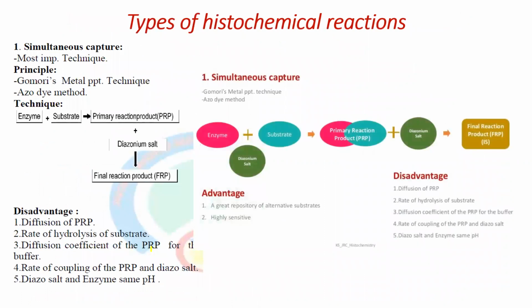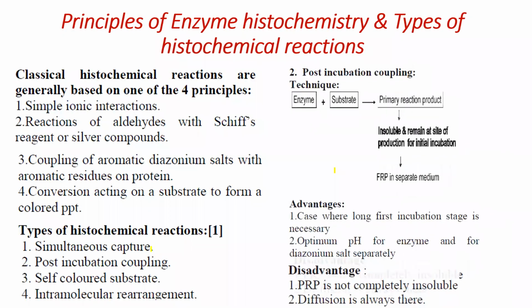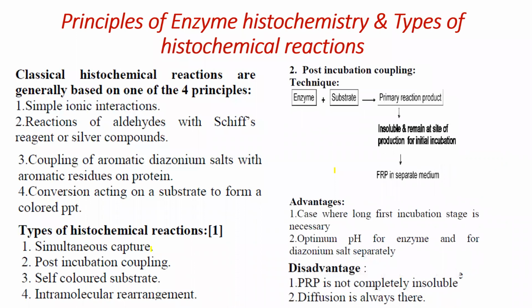So in simultaneous capture, the reaction is very fast, whereas in post incubation, the bonding is very strong. So in order to break down this product and to develop color, it will take more time. So we need to keep it for incubation to develop the color. That's the only difference between simultaneous and post incubation coupling.